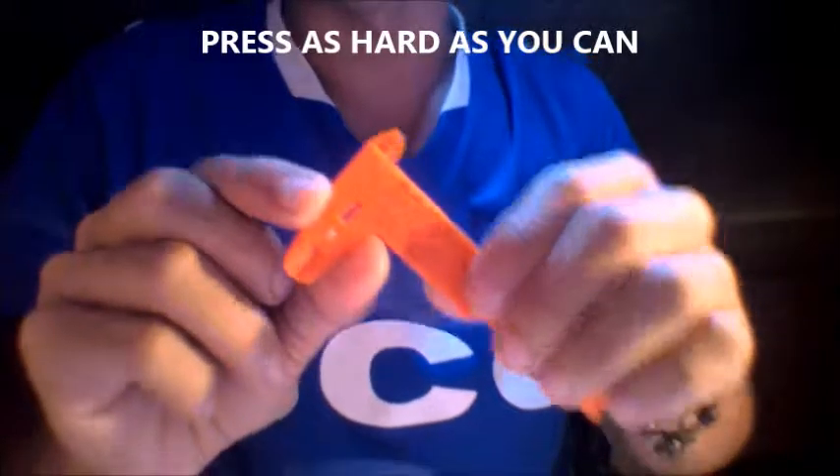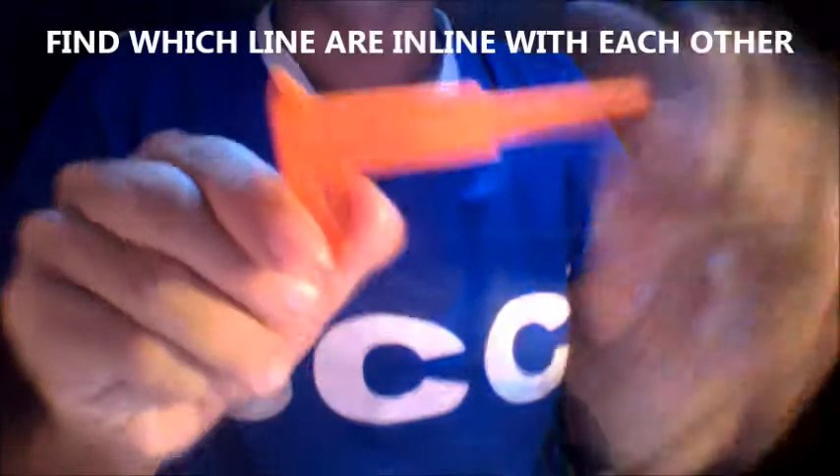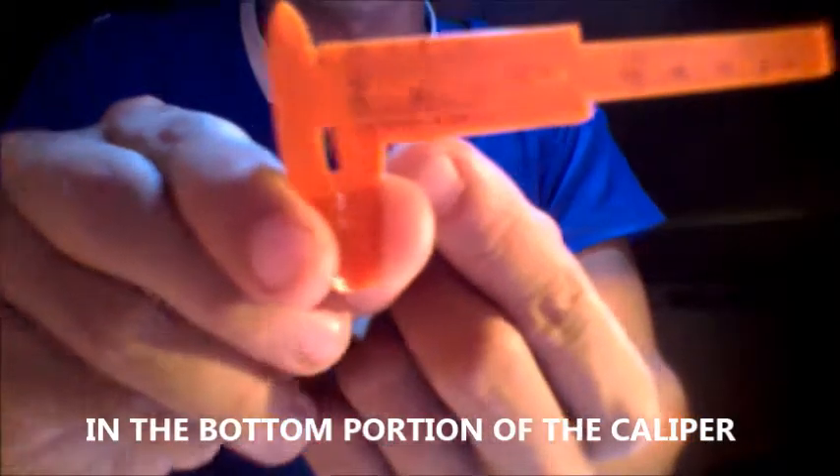Press as hard as you can, and find which lines are in line with each other in the bottom portion of the caliper.